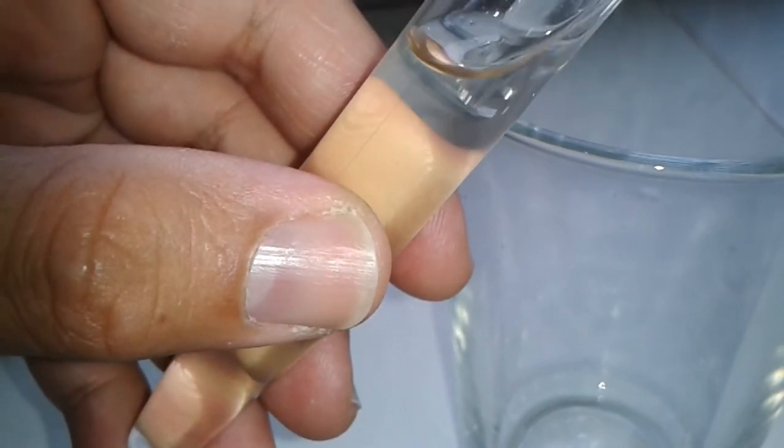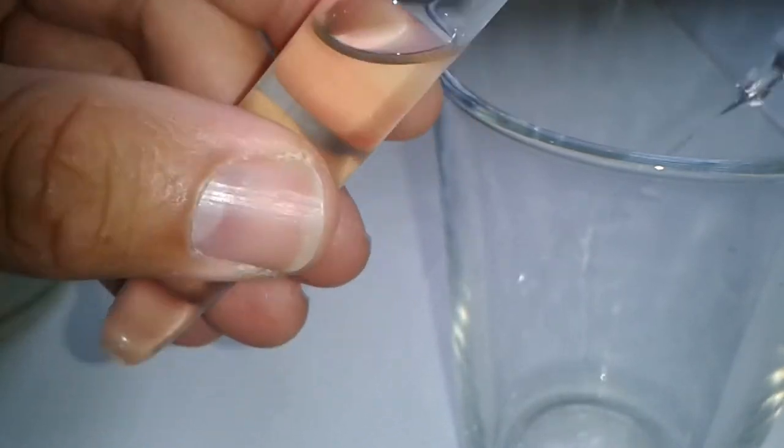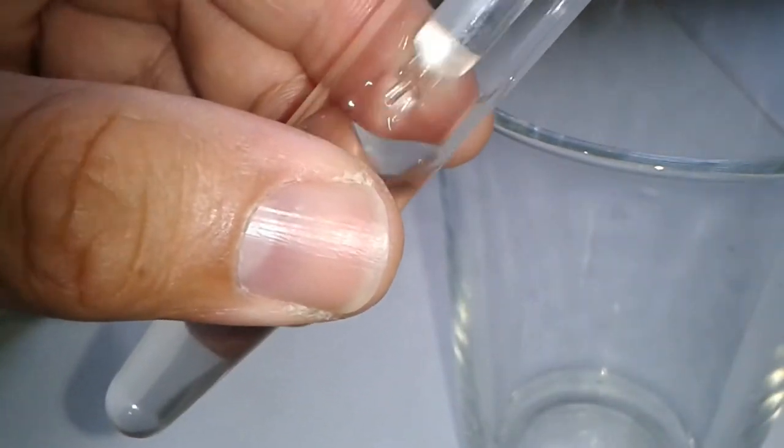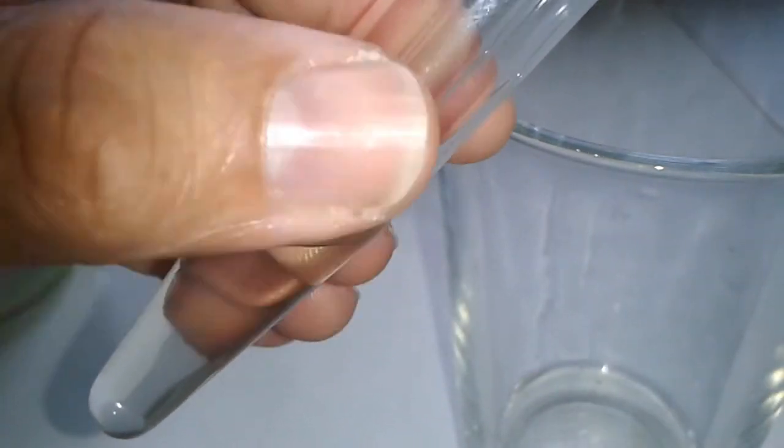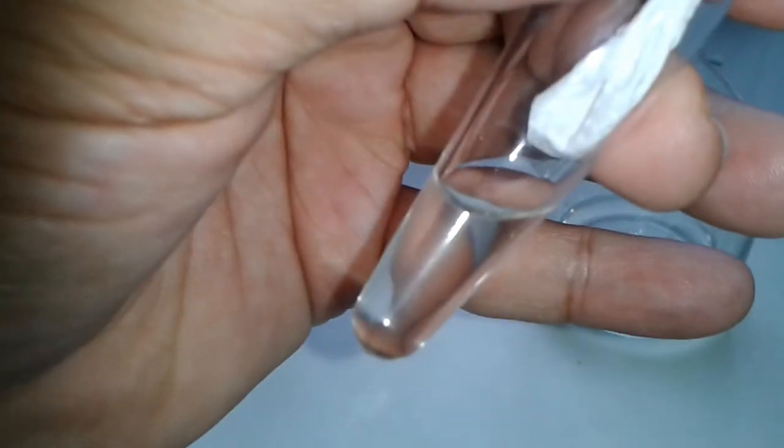And I'm carefully now removing the so-called supernatant, so basically the liquid at the top. And I'm using this with a pipette. And this way, I'm not disturbing the pollen which has collected on the very bottom of the tube.